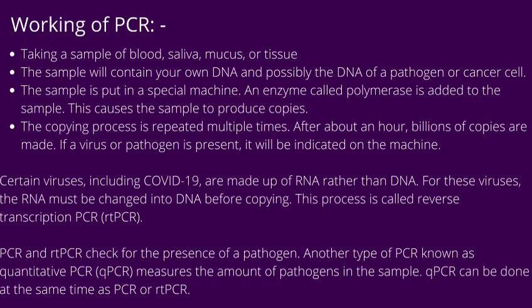Another type of PCR, known as quantitative PCR, qPCR, measures the amount of pathogen in the sample. qPCR can be done at the same time as PCR or RT-PCR.